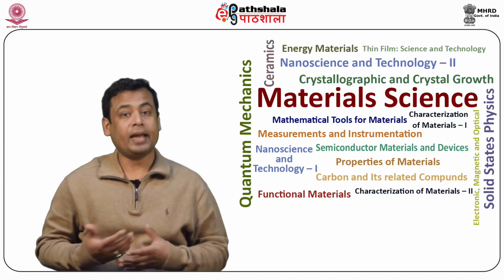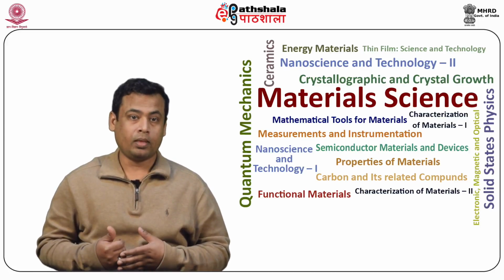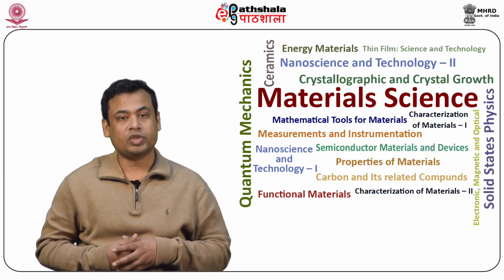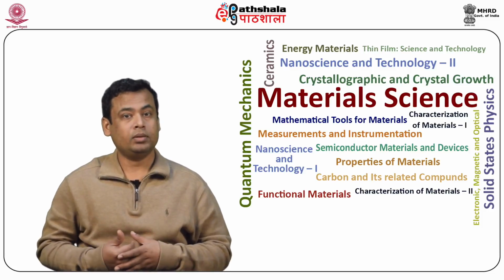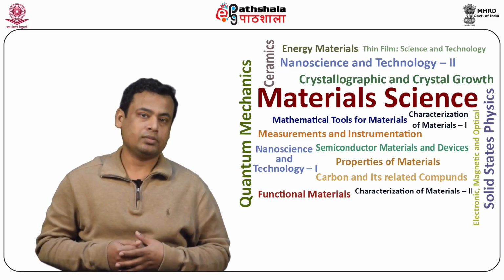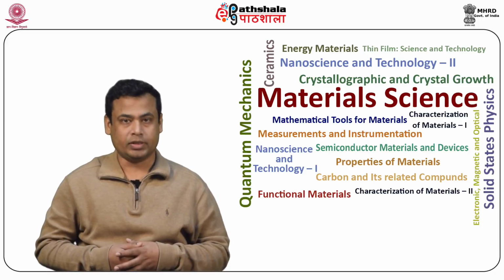The accurate lifetime measurement requires photodetectors and signal processing electronics with sub-nanosecond precision. In the time domain, femtosecond or picosecond pulsed lasers are often used as excitation light sources.